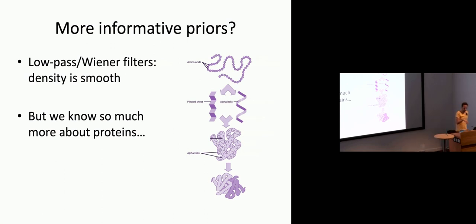that, you know, this big question: what do I know about the reconstruction I'm going to make in the absence of any data yet? You know, I do know a lot. It's made of a protein. I often even know which protein it is, and I don't know its structure yet, but I do know it's an amino acid chain. Perhaps it has a nucleotide chain as well. It will probably have alpha helices or beta sheets that I could predict, etc.